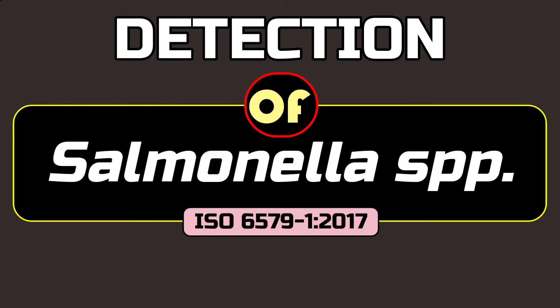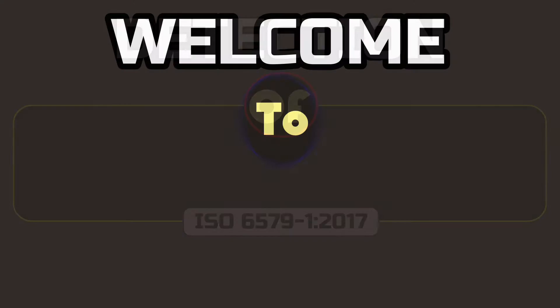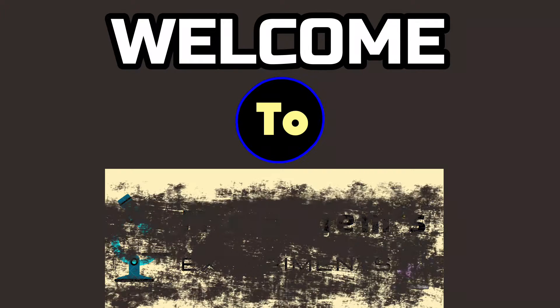Hello viewers, today we are going to detect Salmonella species. This video represents part 1 of this technique, where we are going to isolate Salmonella. For the identification of Salmonella, please take a look at part 2. Welcome to MicroKame's experiments — be with us, be a laboratory expert.